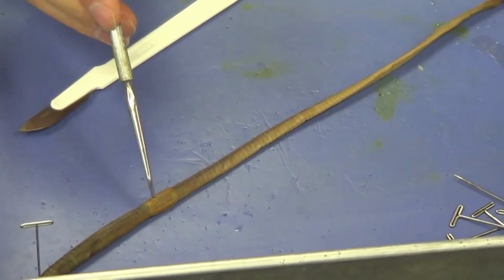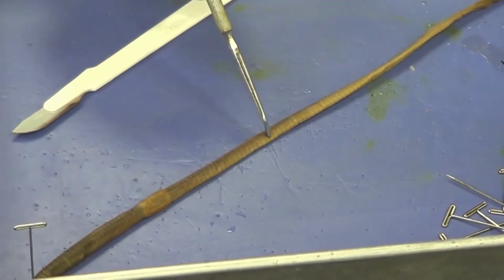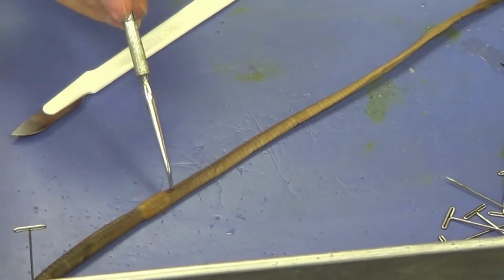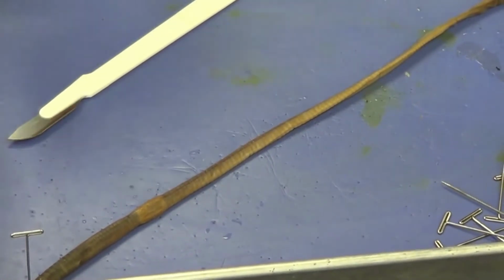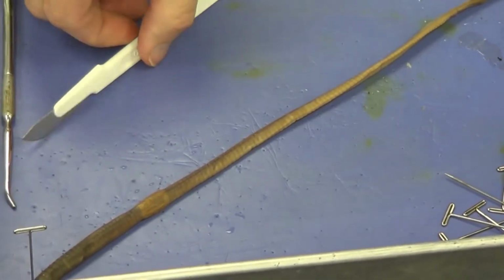I want you to start posterior to the clitellum, because the only structures in here are essentially the intestine. So this is where I want you to practice. And if you make a mistake, it's not going to be too terrible. So we're going to start dissecting there.